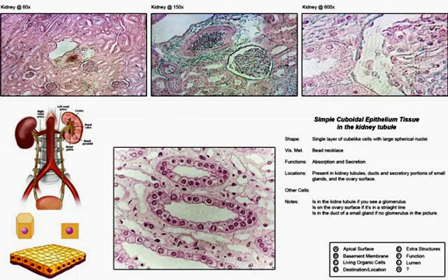Here are some of them at lower magnification that are circular, and if you cut it at an oblique angle, many of them might appear as an oblique structure like we see here, or fully magnified right here. Regardless, both examples here and here of kidney tubules are lined with a simple cuboidal epithelial tissue that has the ability to secrete or absorb the filtrate's materials in and out.